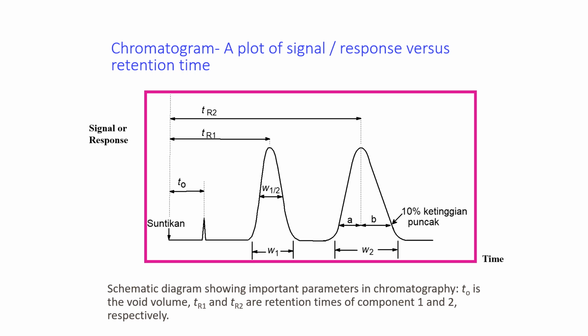Okay, hi. So this is the second part of the introduction for chromatography. This slide is showing you the output of any chromatography instrumentation. It is the chromatogram. It is a plot of signal or response versus retention time.